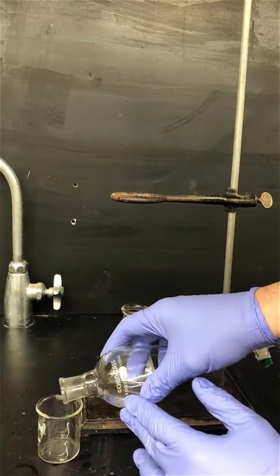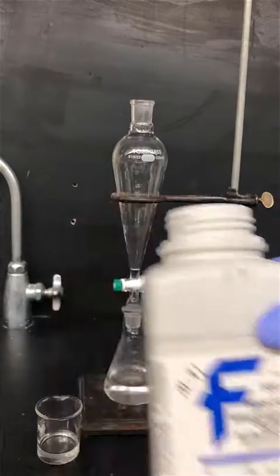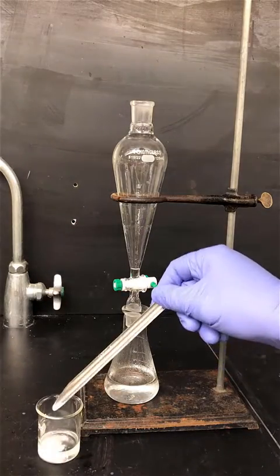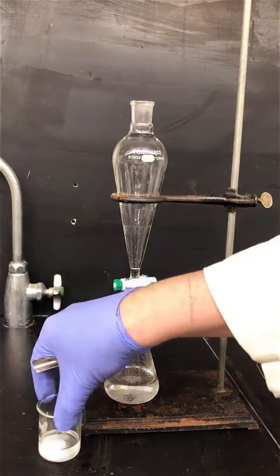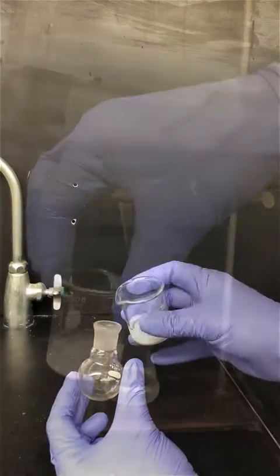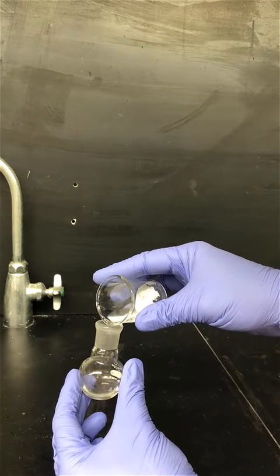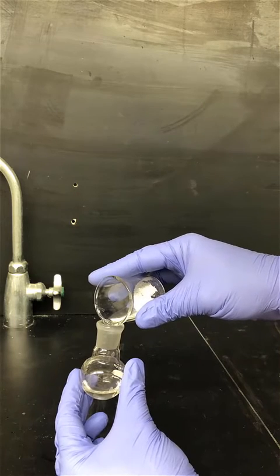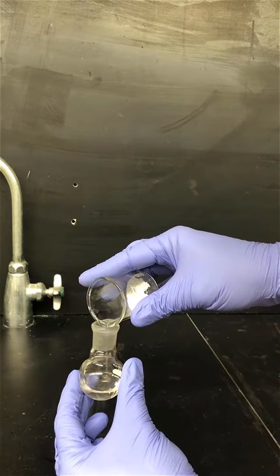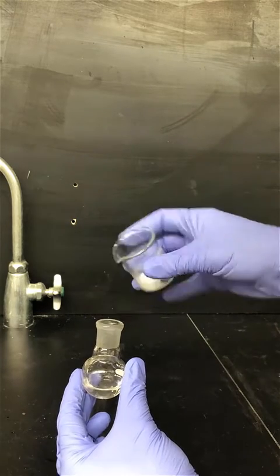Pour the organic layer out of the top of the separatory funnel into a clean dry beaker. Next, add magnesium sulfate to dry the solution. You'll know you've added enough if you swirl it around and it remains free flowing — if it's completely clumpy you'll need to add some more. Decant the solution out of the beaker into a clean dry round bottom flask, pouring carefully to avoid having the drying agent slip by. At this stage you're ready to go on to step three: distillation.